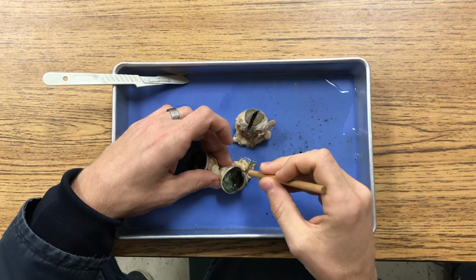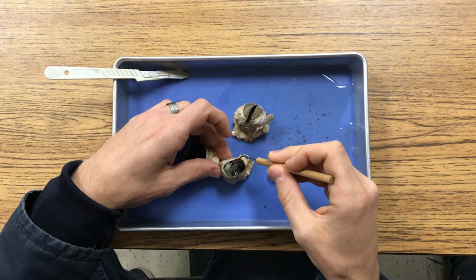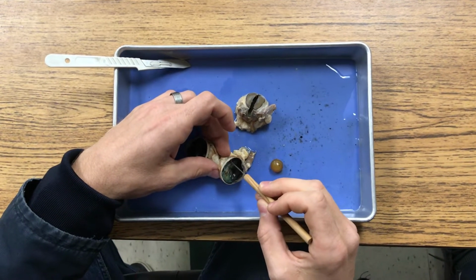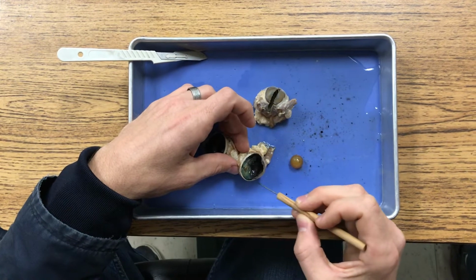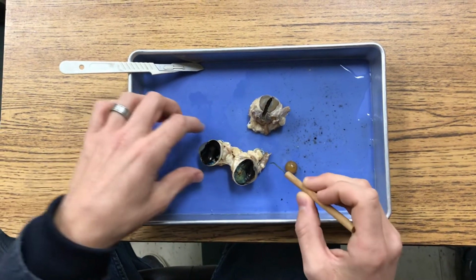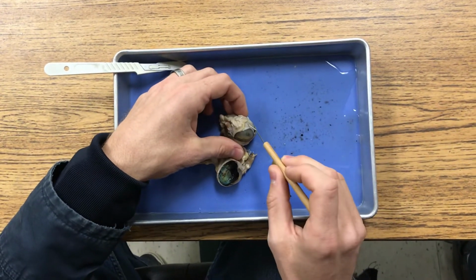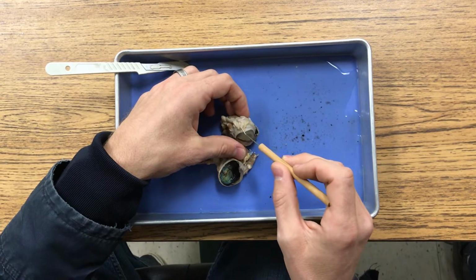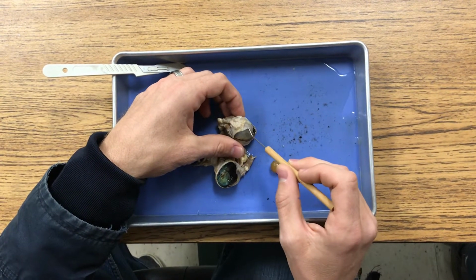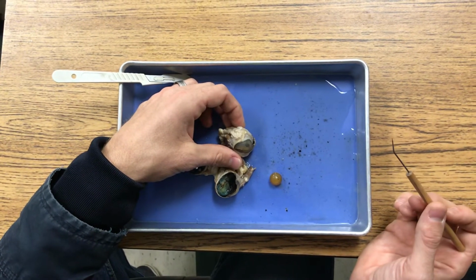All right, so the retina layer, the tapetum, and then you have the choroid, which is the vascular layer, and then the sclera, which is this white fibrous layer, and that goes all the way around the eye, and that's the white part of your eye. All right, we also then have, so this has some of the tissue still attached, okay, and between your eyelid and the sclera is a membrane called the conjunctiva, and that's what gets infected when you have pink eye.